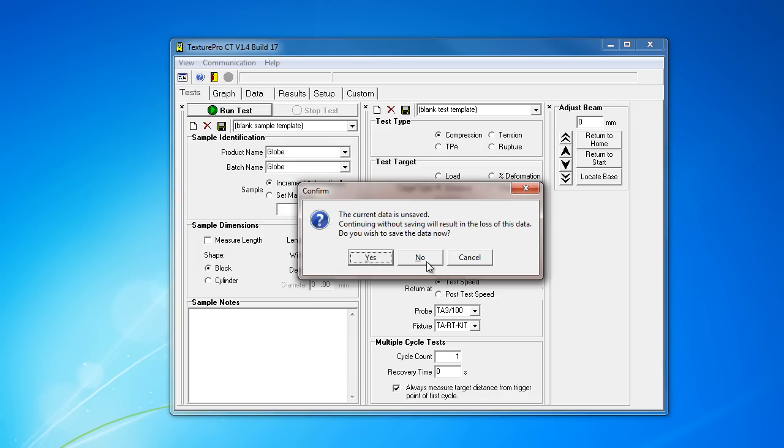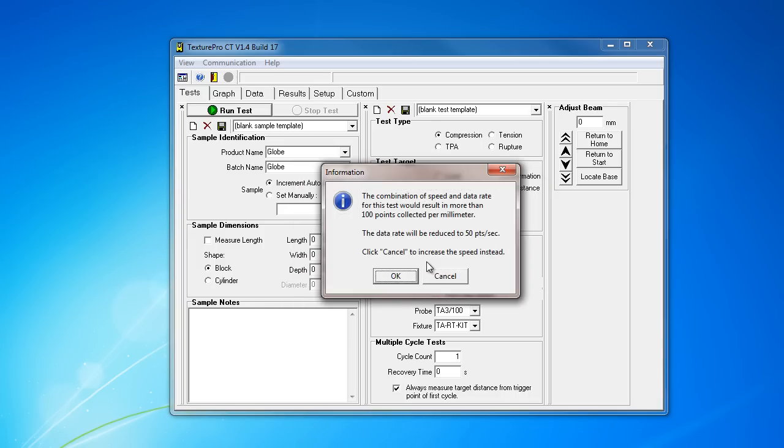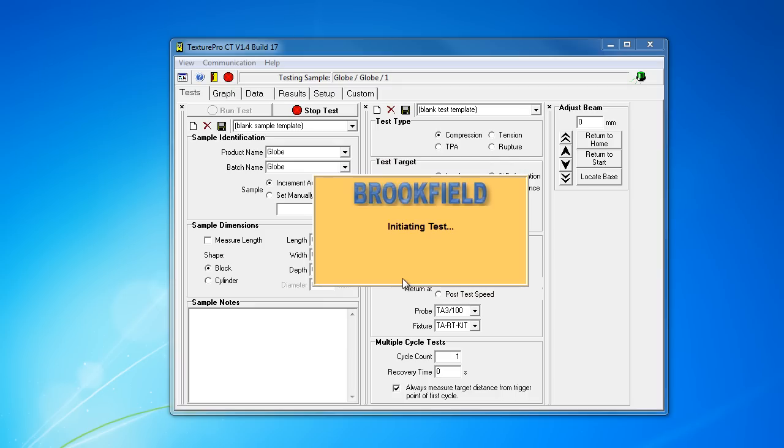Then it asks me if I want to save the previous data, which I don't because it was a false trigger. Same error from before. I'm just going to run this test.